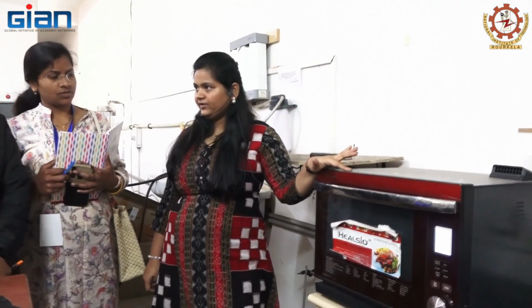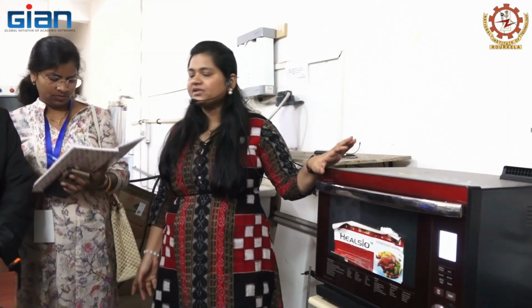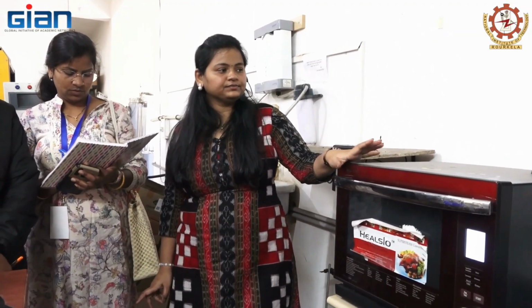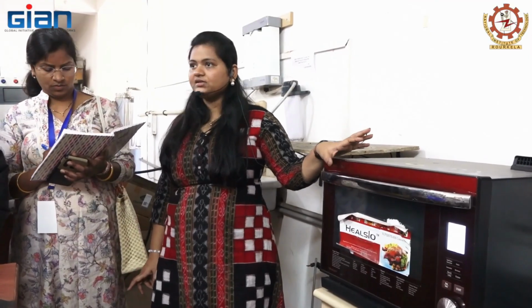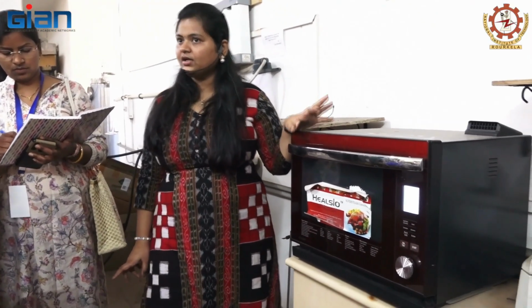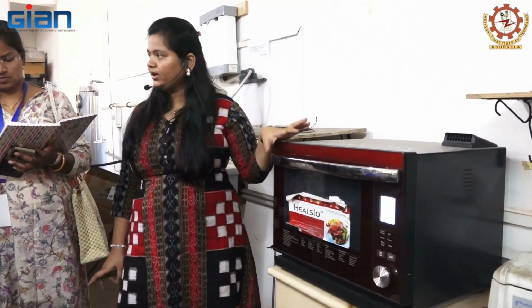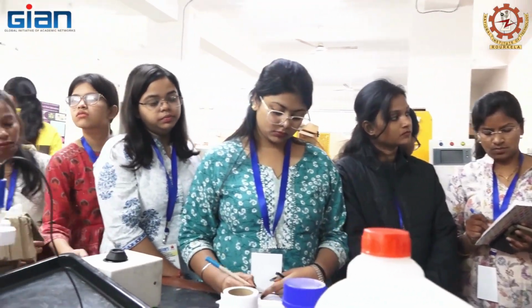A domestic type microwave oven, you may also have one in your home. In that, I am showing you what the parts or components inside it are. One is the microwave generator, which has the magnetron inside it, which is responsible for the power frequency of the microwaves, and it also converts the electric field into electromagnetic fields.